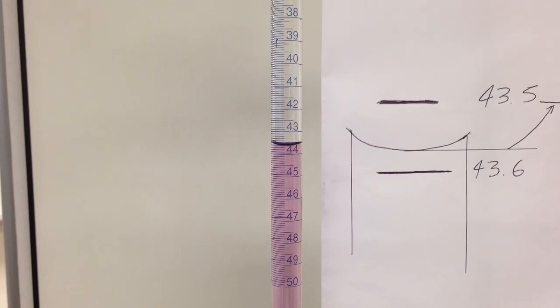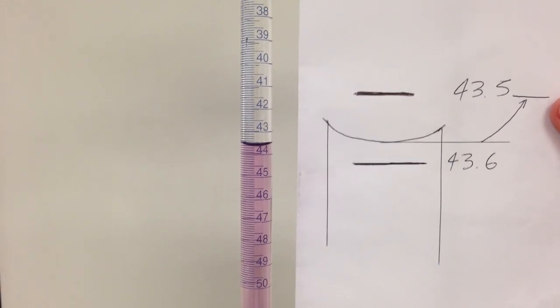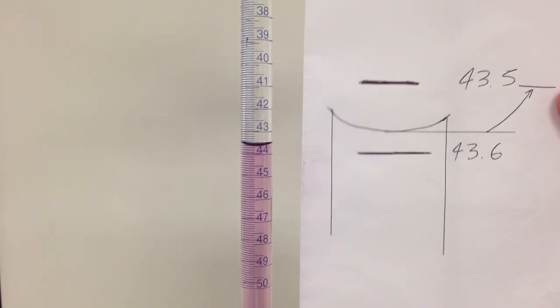Here the bottom of our meniscus lies between 43.5 and 43.6. My estimation would be 43.56 milliliters.